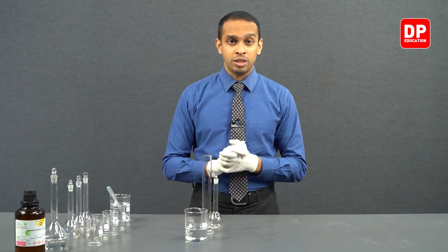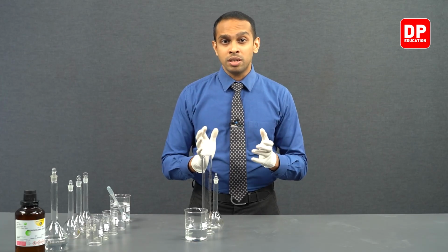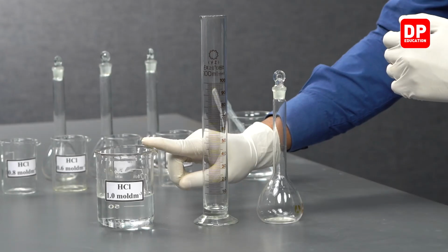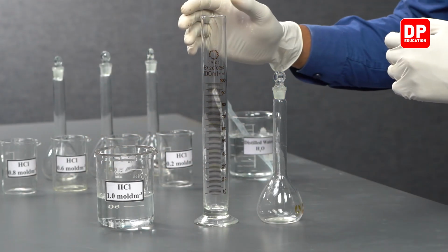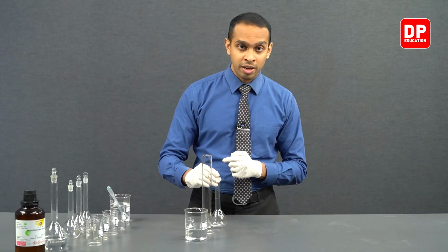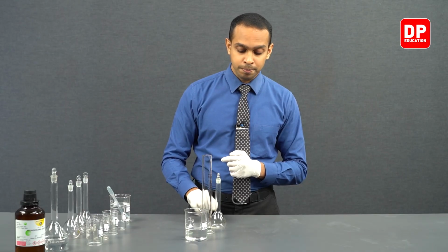So to produce it, what did we do? We measure 80 milliliters or 80 cubic centimeters of 1 mole per decimeter cubed HCl and transfer it to this volumetric flask, and then we fill it all the way up to the calibration mark.